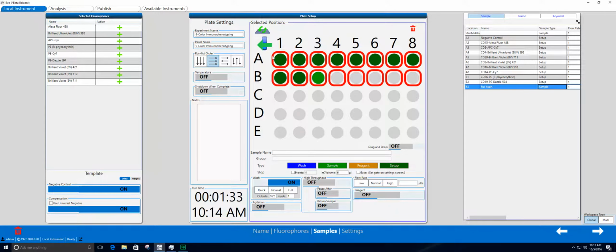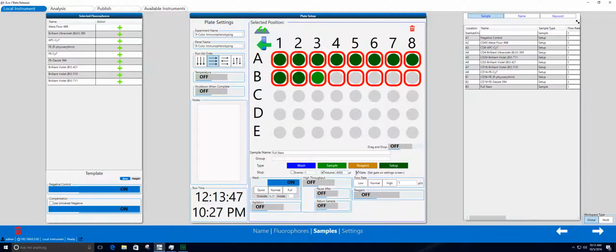Select all of the wells to modify the sampling parameters. Click the Gate checkbox to set a gate limit in the next screen. The volume limit defaults to the maximum for the media type you are using. Be sure to change the volume to reflect what is actually in the tube or well. Activate Return to Sample if you would like the unused sample deposited back in the tube.